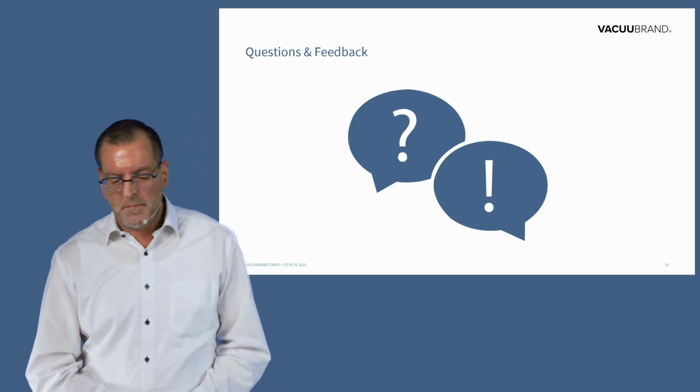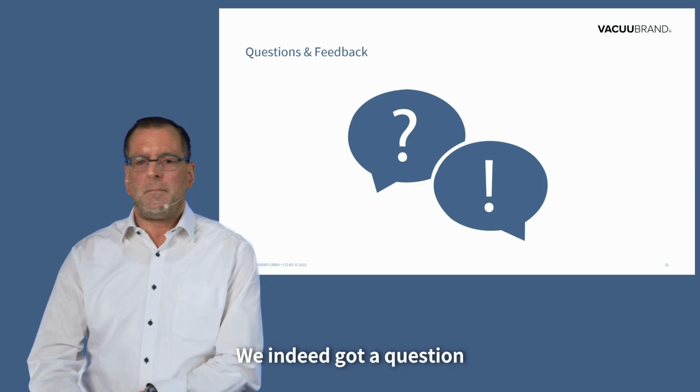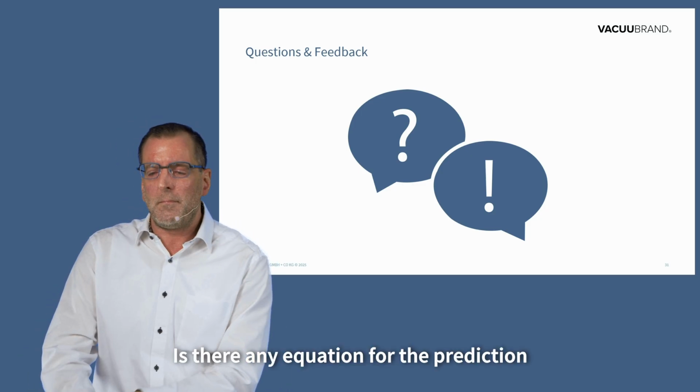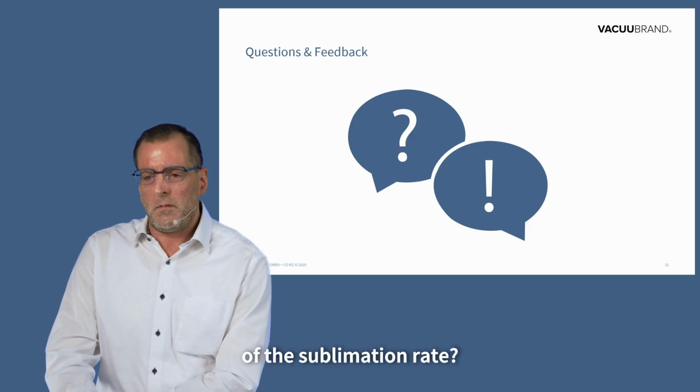Thank you, Carsten. We indeed got a question about the sublimation phase. Is there any equation for the prediction of the sublimation rate?